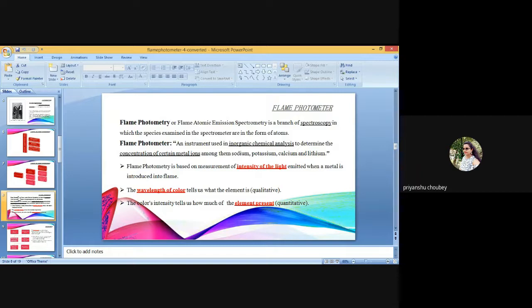Use all the tubing of the prescribed diameter or color code as given in the application notes. Check all the tubing before use for clogging of the passages. Maintain different manifold units for different analytical methods to avoid sample contamination. Use a solvent-resistant manifold for organic solvents. Never use an organic solvent on a plexiglass manifold, not even for cleaning.